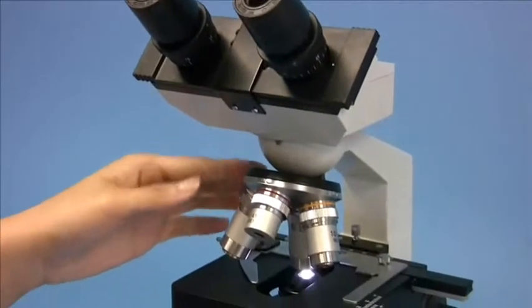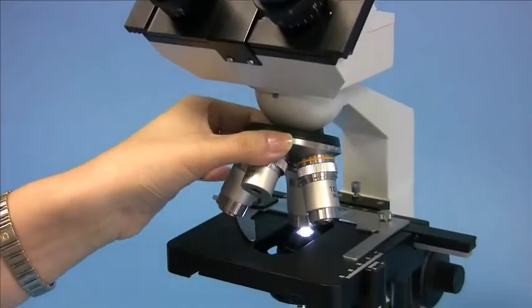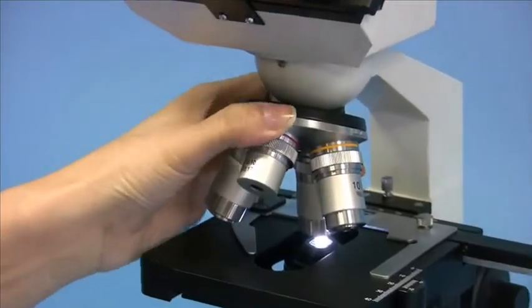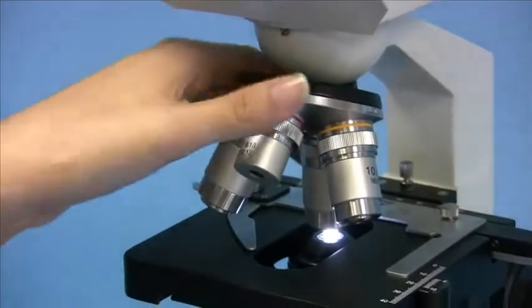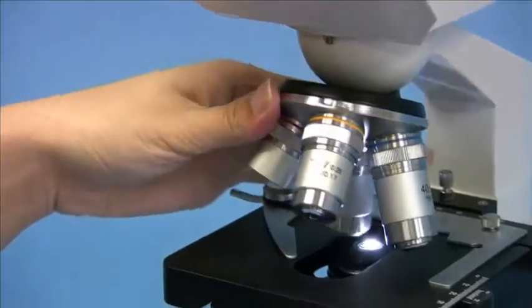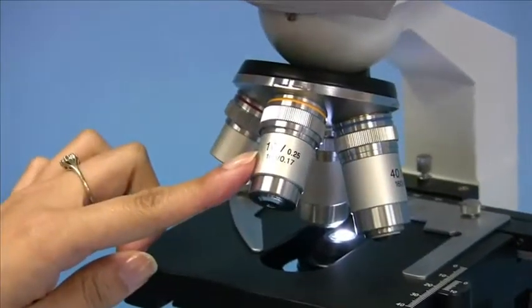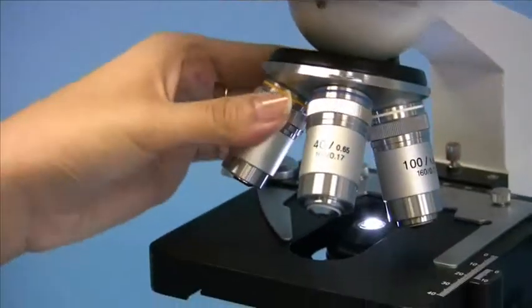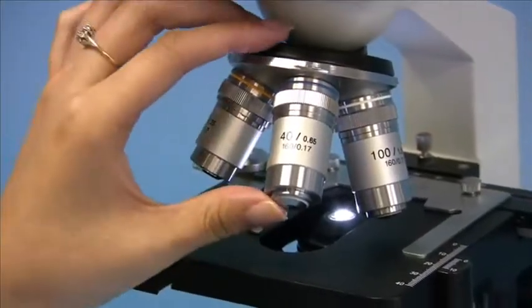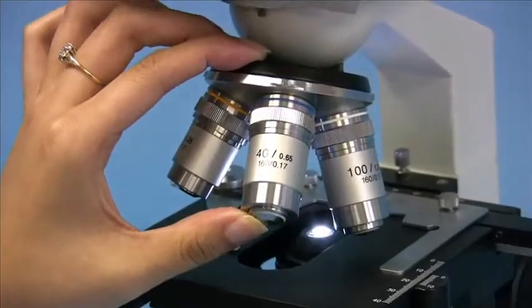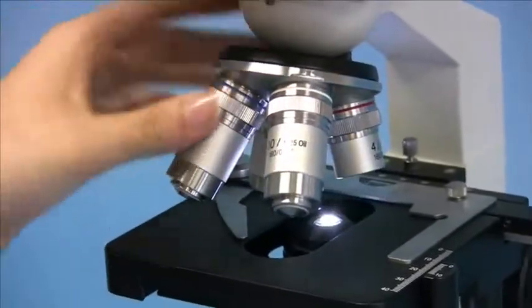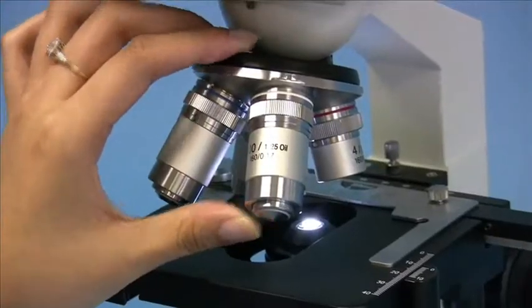Moving down to the nosepiece, the revolving nosepiece is mounted by four objective lenses. The 4 times magnification, the 10 times, the 40 times spring-loaded, and the 100 times spring-loaded oil objective.